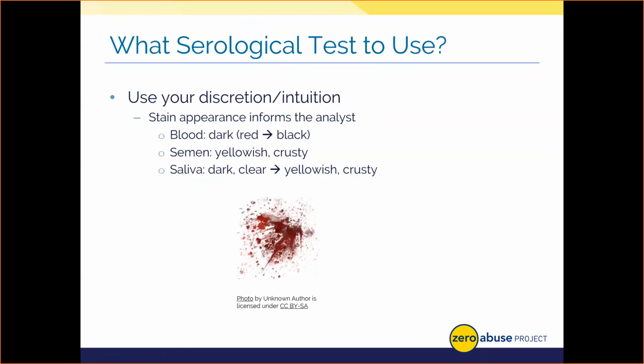Please note that today I'm mostly talking to you in terms of single body fluid stains. Mixed stains can be a completely different element altogether, and there might be different testing methods and procedures based on your laboratory's standard operating procedures, or SOPs. I will tell you that there's actually some work out there on how we can, in one fell swoop, analyze stains and determine multiple stain sources in a mixed stain, but that's a discussion for another time. Most of that is embedded in research currently.